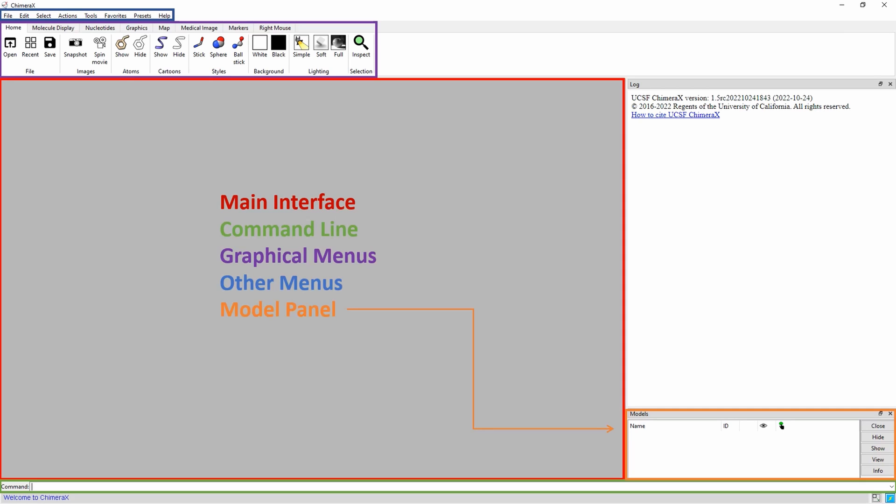The log, highlighted in yellow, provides a history of all commands and actions taken. The log shows exactly how each action would be performed using the command line. This allows you to replicate a certain instance by copying and pasting from the log into the command line. The log also displays information about each chain and model when they are loaded. Note the log does not save when Chimera is closed.